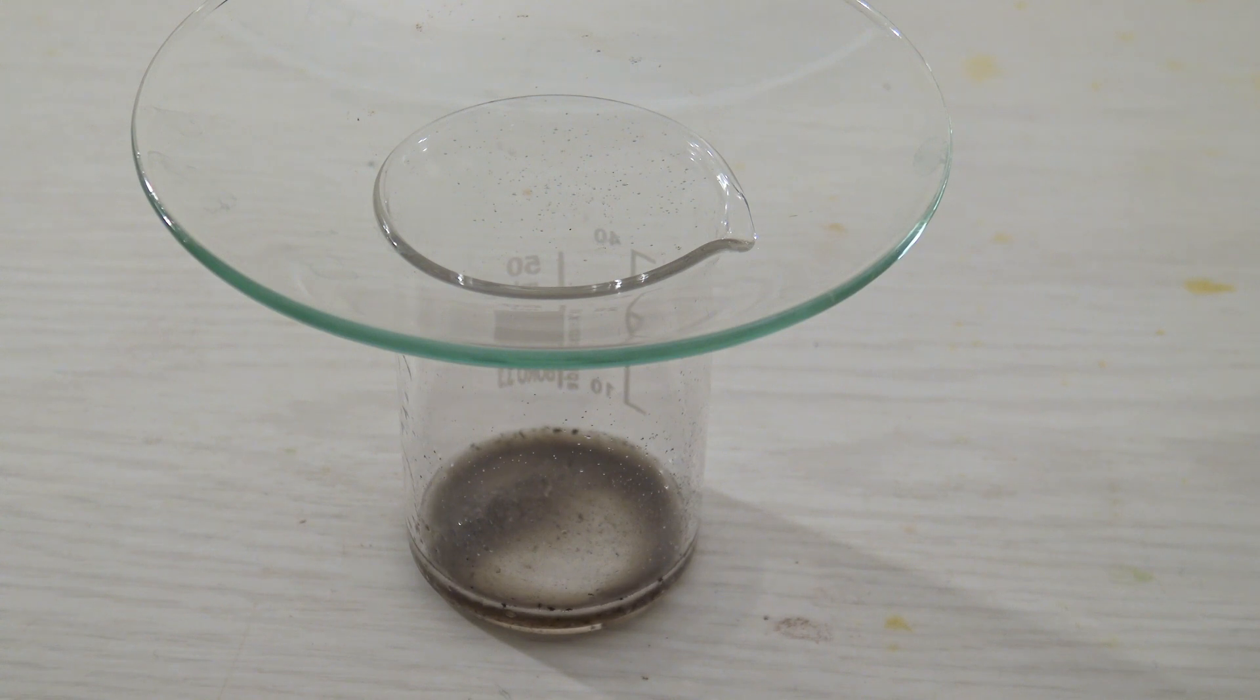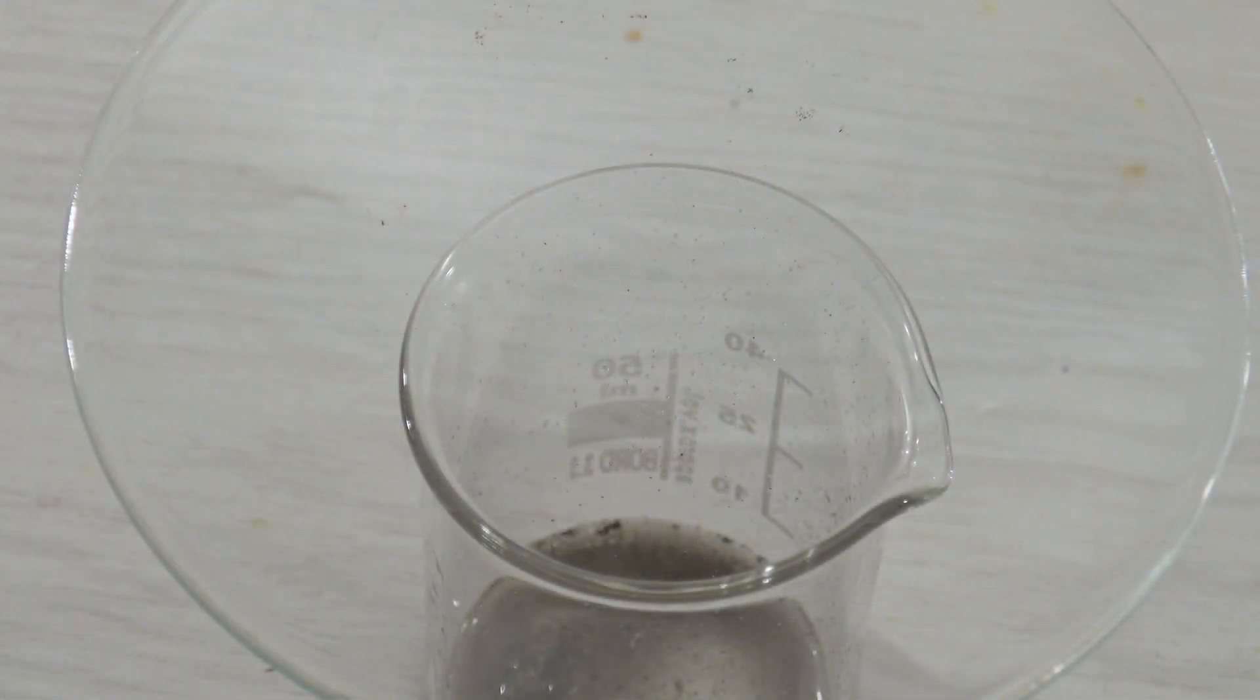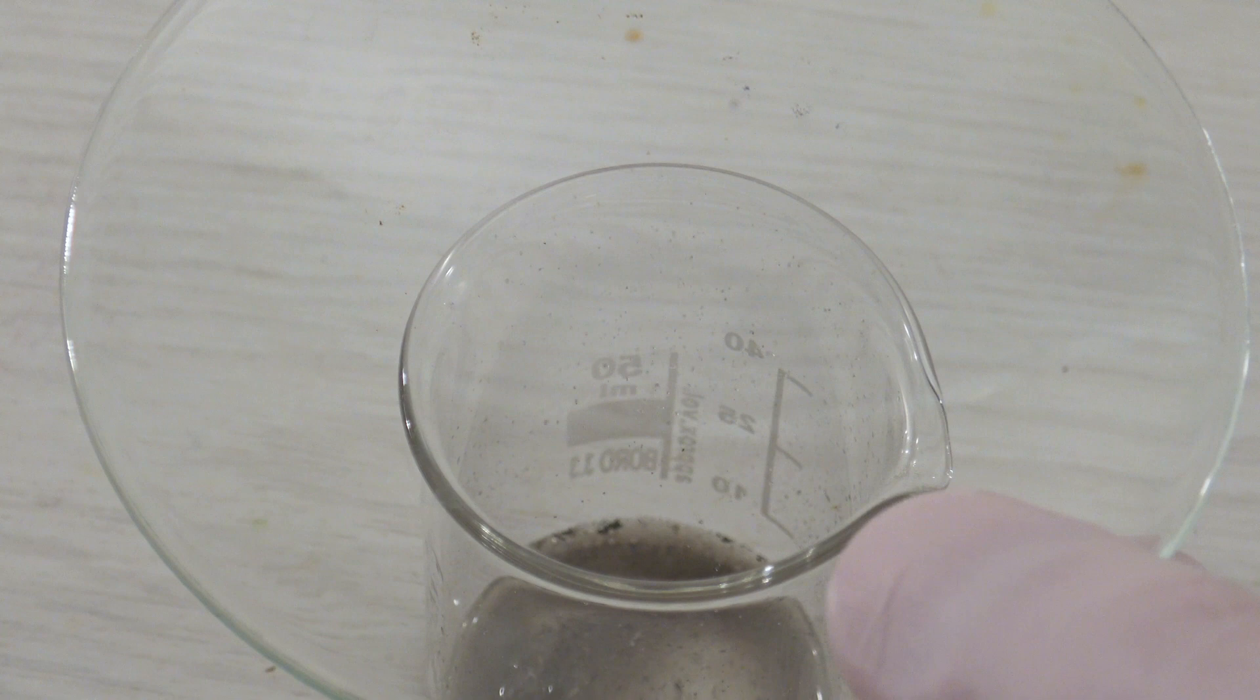Usually, lead acetate paper is used to find out if hydrogen sulfide has formed. In this case, paper was used that had been soaked with lead nitrate, but the reaction is practically the same.